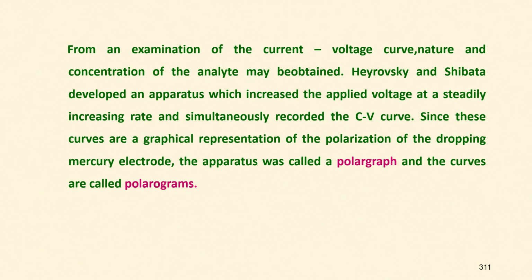Or whatever it is, the sample will not reach the electrode in sufficient quantities. So, the bulk of the current is carried by the indifferent electrolyte, it does not reach the electrode because it is indifferent to the applied voltage, and whatever ions of the analyte reach the electrode by carrying the current, it is so small that it has no effect on the overall reaction. That is the basic system.